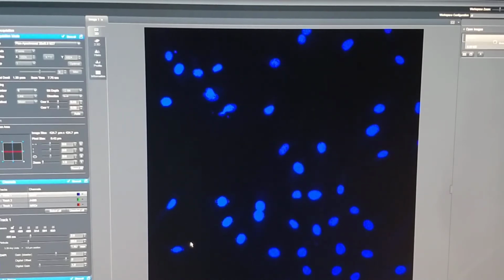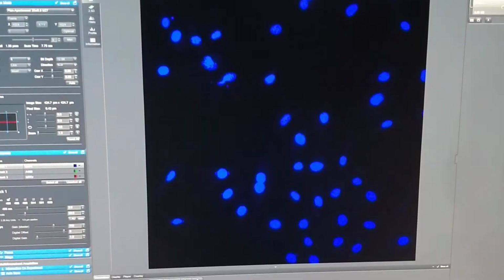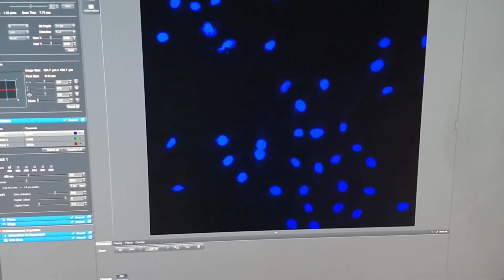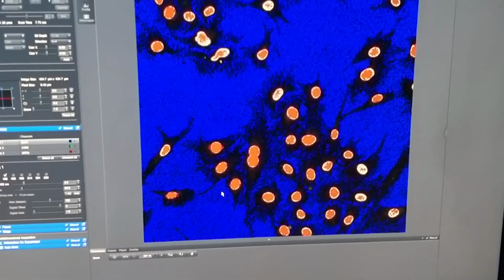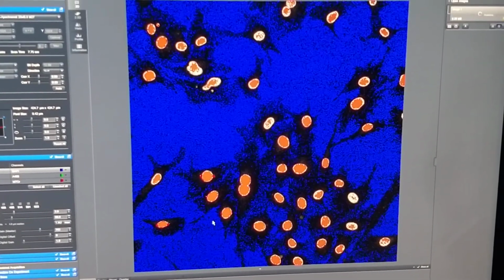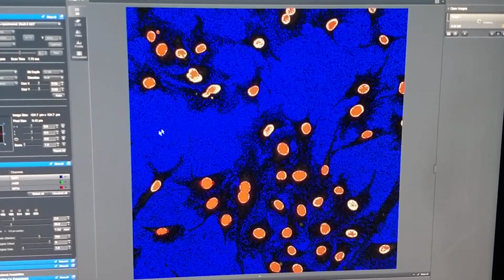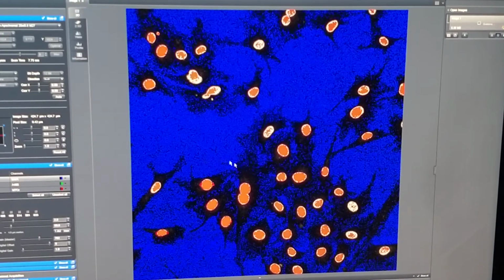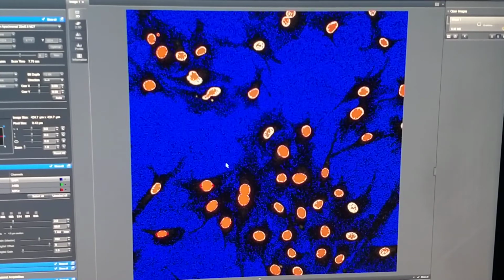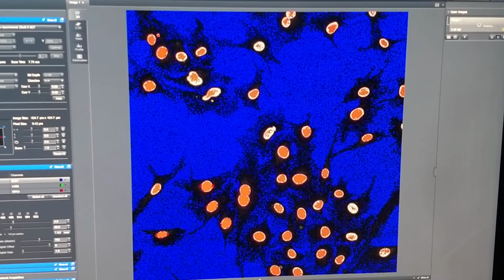And then at this point, if you click on here, you can see there is the small rectangular shape here. If you click on here, this is the high-low mode, or the saturation checker, okay? So what this means, the blue means there's zero signal. Black, if you see any black here, it means they are signal, but generally they're not visible by eye. You see gray all the way to white. Those are the signals that you want to see.